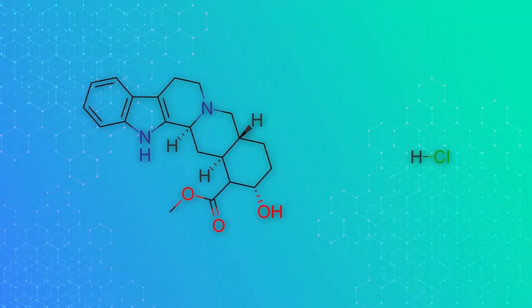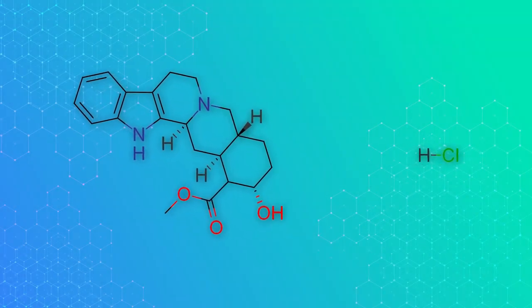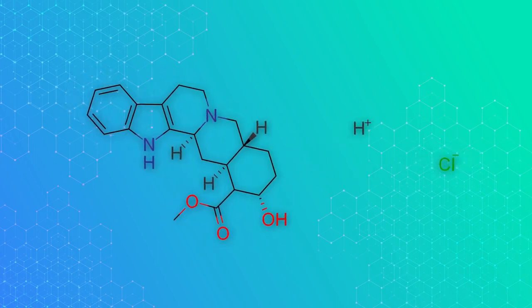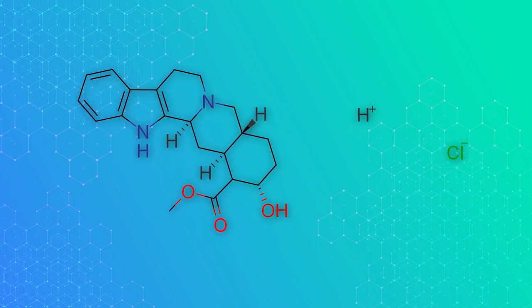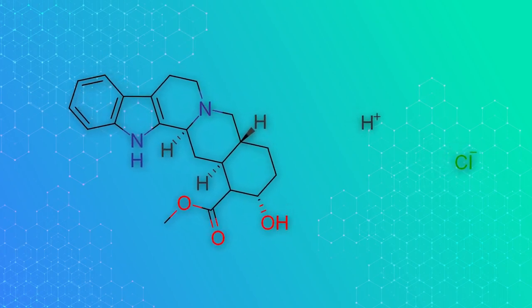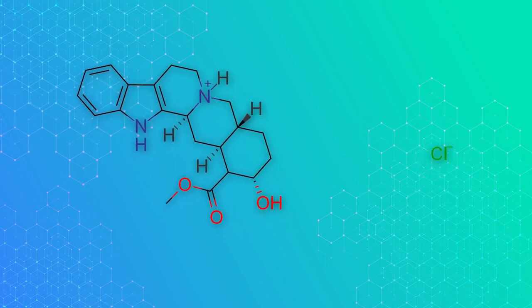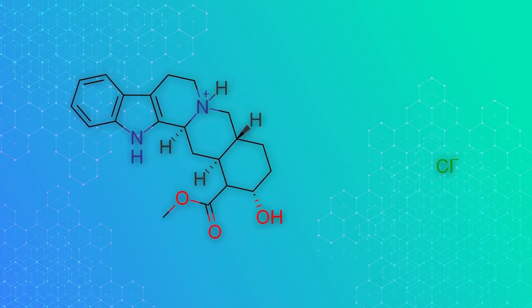Determining a salt from a co-crystal can be a challenge. To do this, we need to resolve the position of hydrogen atoms. In MicroED experiments, if the hydrogens have a strong contribution to the diffractions, we can resolve the hydrogen positions and we can determine if hydrogen transfer occurs between the active ingredient and the ligand. Furthermore, if the sample is a salt, we can determine which atom in the active ingredient is protonated or deprotonated.